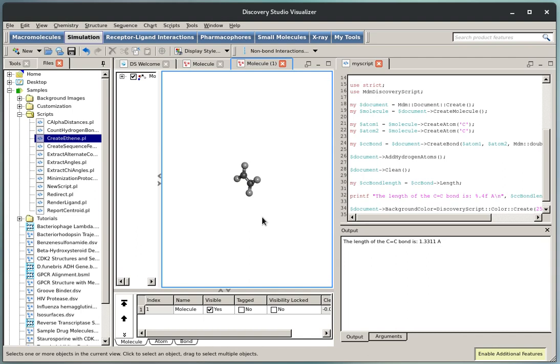There's no right way to visualize it. You need to visualize it in a way that is comfortable for you, a way that you're happy with. If you have a mouse on the computer you're working with, you can roll the middle mouse button to make the molecule smaller or bigger, and if you right click and drag you can rotate and view what the theme looks like.